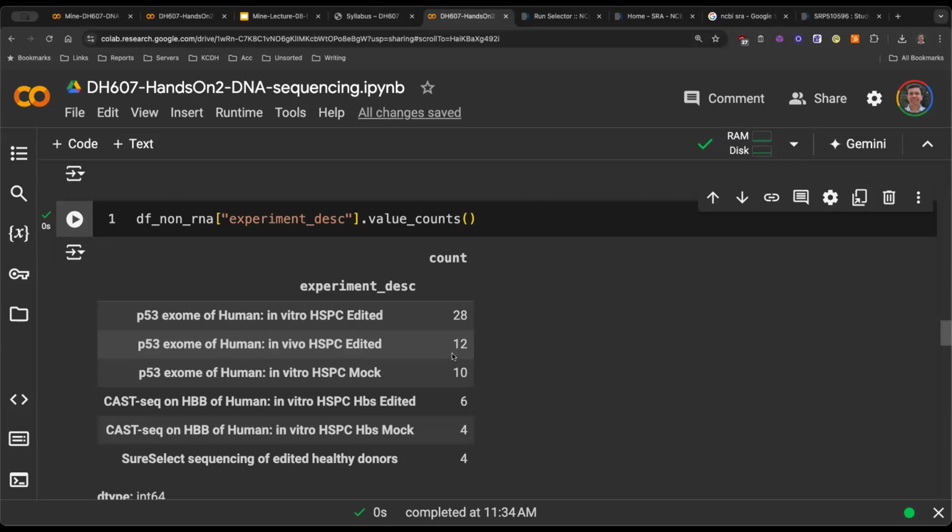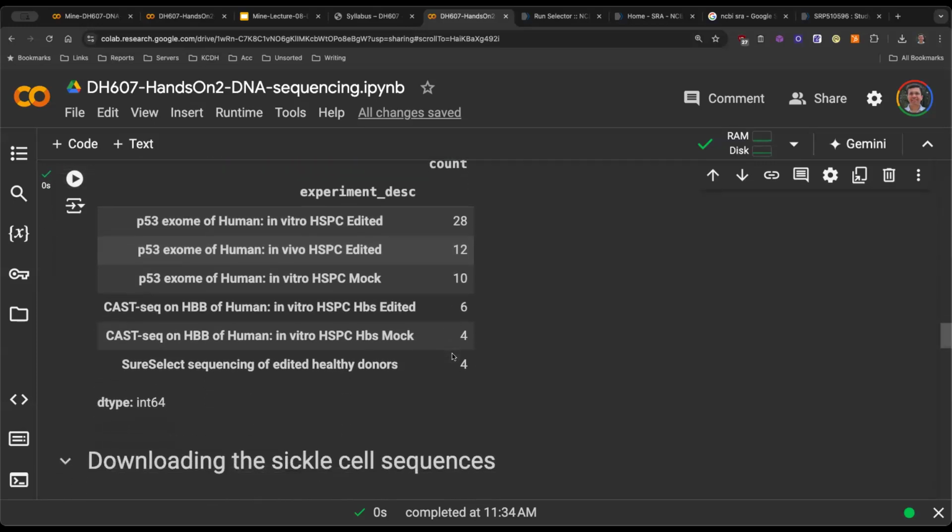The goal for this workshop, or this tutorial, is to show you whether this mock experiment is correct or not. How do we identify whether it's correct? Well, if there is a therapy to fix it, we should at least be able to see whether whatever is being fixed actually existed to begin with.